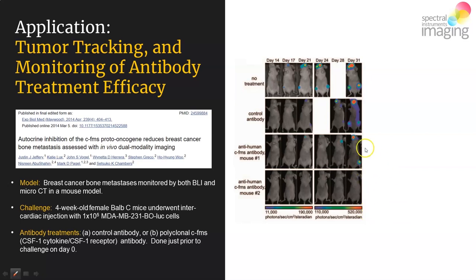So in summary, this is a success in 2 ways. One, in that you see the ability to detect metastatic lesions in the bone microenvironment quite nicely. And secondarily, you see the moderate effect of the novel therapeutic in the ability to reduce the instance of metastatic lesion formation.